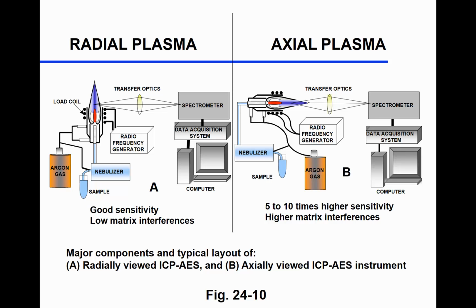Oh no. Is there a difference in cost to have it set up as a radial plasma versus axial? Is there a reason? I don't know if there is a difference in cost. Good question. I don't know.